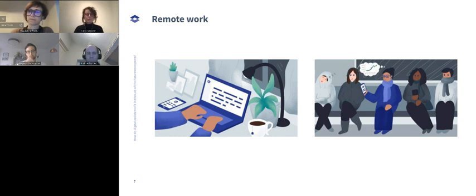There's actually a third use case that has come about, especially in the synthetic biology world, in that you don't necessarily just have the scientists who want the analytical data. You have data scientists who want real-time API access to everything, that flows into their own custom data analytics platform, whether it's Splunk or whatnot. And so for folks like us that are trying to build that connectivity layer, there's the analytical raw data, there's real-time API access we need to solve, and there's IT security issues we need to address, and then there's consolidated utilization and statistical summarized aggregate data that we also need to present to different stakeholders. That's the overarching set of use cases that we've seen become dramatically more visible this past year.